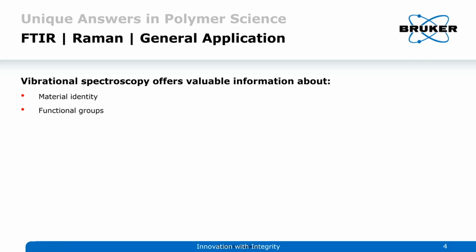You'll look at functional groups. Each functional group has its own characteristic absorption position in the middle infrared region of the electromagnetic spectrum. And for Raman, even though we're looking at the Raman shift, that Raman shift takes place in the same region of the spectrum. So whether we're talking about IR or Raman, we're looking at those first vibrations, the ground state to the first excited vibrational state. And in those areas, each functional group pretty much has its own fingerprint signature.